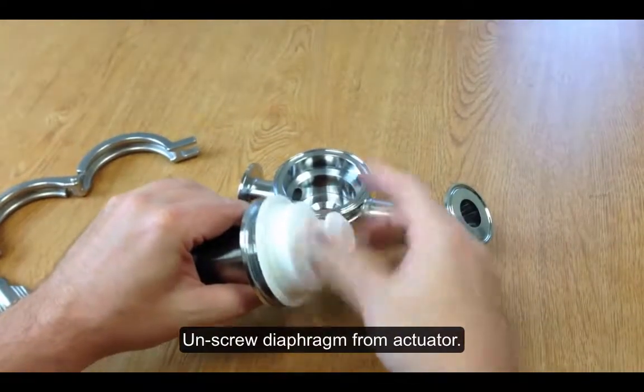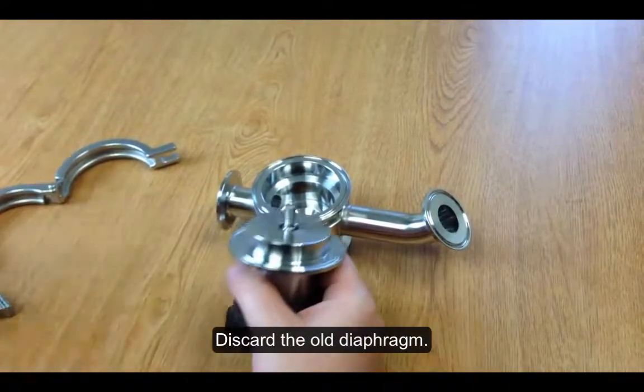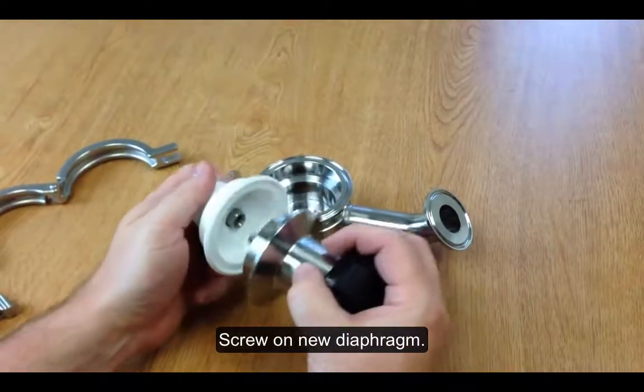Then you'll take the diaphragm off of the actuator and discard it. Then you'll install your new diaphragm.